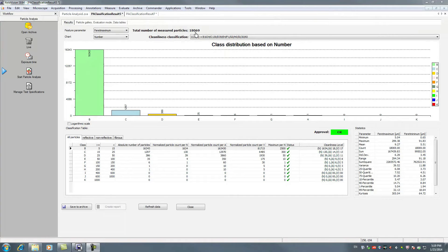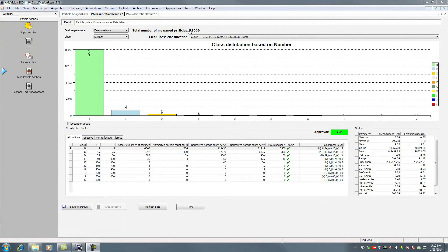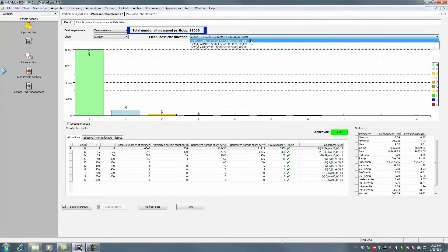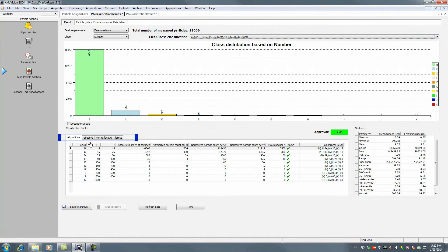In the summary view, you will receive information on the total number of particles, the cleanliness code and the class result according to the particle type.